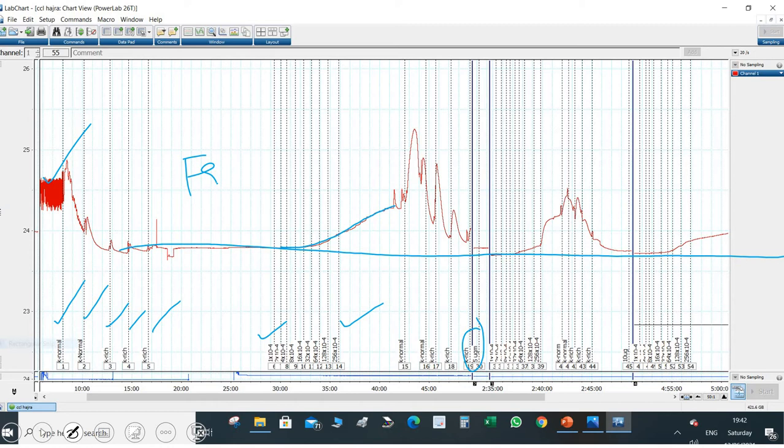So what happens? Once you recalcify with this amount of calcium, it is not going to reach a similar amplitude. If I draw a dash line, this much amplitude is not attained. And in the presence of 10 microgram, again with an incubation period of 1 hour, you see what happens. This is a very small amount. More channels are blocked, and it's not going to reach the height gained by the control.